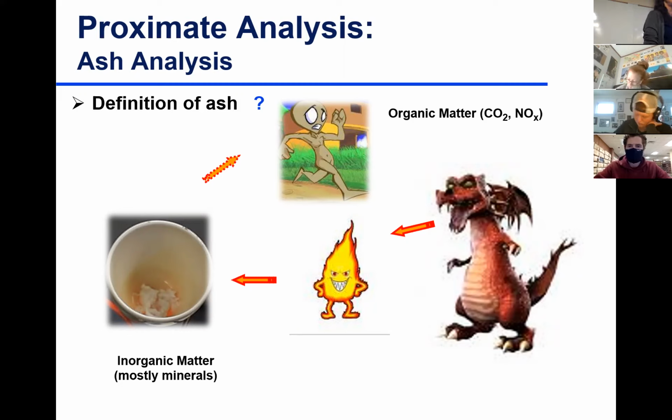But in theory, when you look at your ash, if it's a whitish color, you would go, okay, I got rid of most of my organic matter, or all of my organic matter.